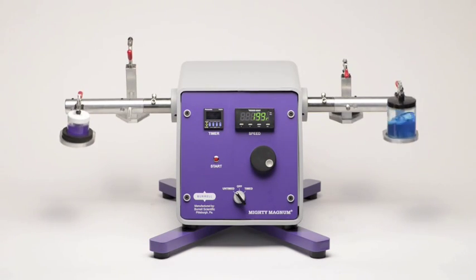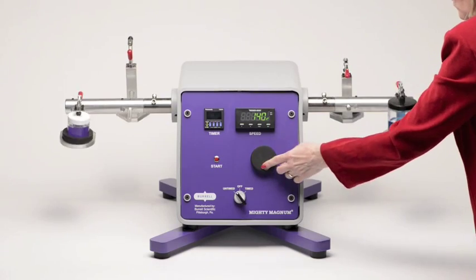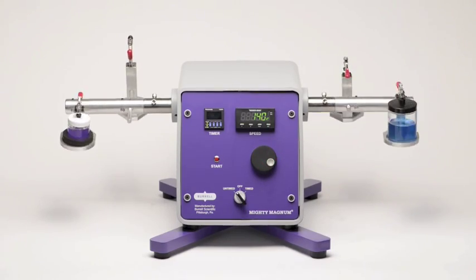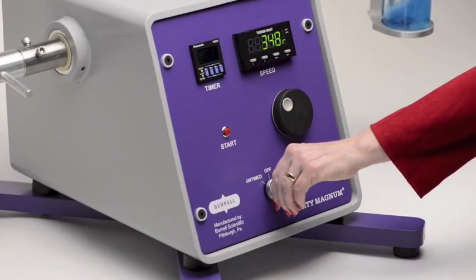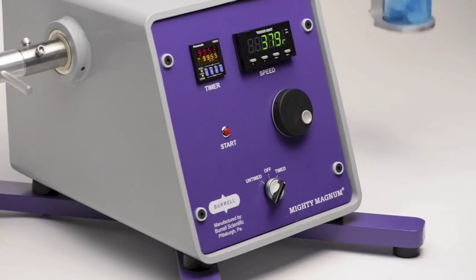The speed indicator turns red at 500 plus oscillations per minute. The timer can be set from 1 second to 99.99 minutes.